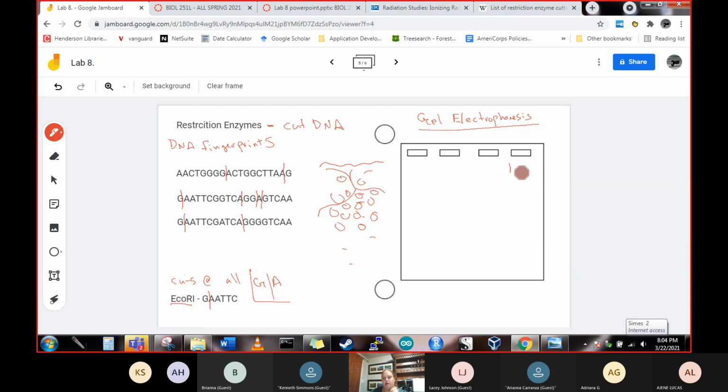So you have your long pieces of DNA up here, and you have short DNA down here. And you get basically a gradation of all of your different pieces as they go down this gradient. So why do they go down a gradient? Gel electrophoresis machines are charged.